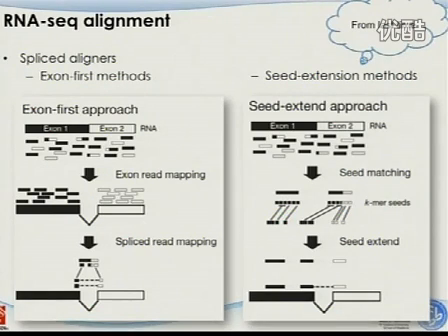And we know that RNA sequencing alignment is different from DNA sequencing because all those short aligners do not allow big gaps, okay? And we know some of the RNA reads, because we are sequencing the transcriptome, are junction reads, and if you align them back to the human genome, you will miss those. So some people asked me after the class, what's the percentage of reads that map to junctions? Can we just ignore those? But think of the length of the reads, let's say 50 base pair or 75 base pair. Do we have an idea how long the exons are?